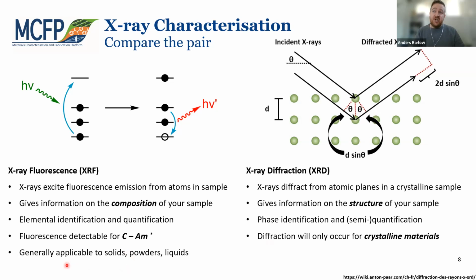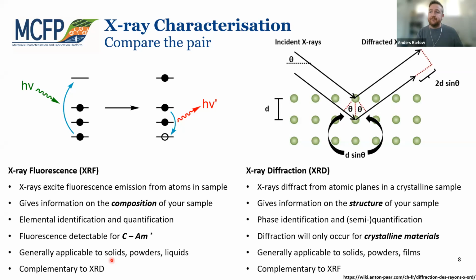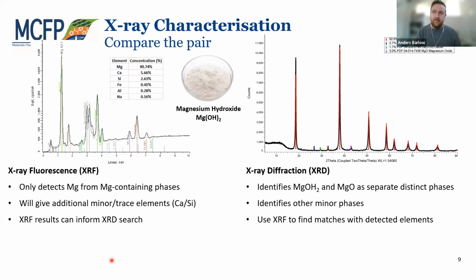XRF is generally applicable to solids, powders, and liquids. XRD is generally applicable to solids, powders, and films. And they are complementary to one another. So we can use XRF with our XRD analysis and vice versa as well.